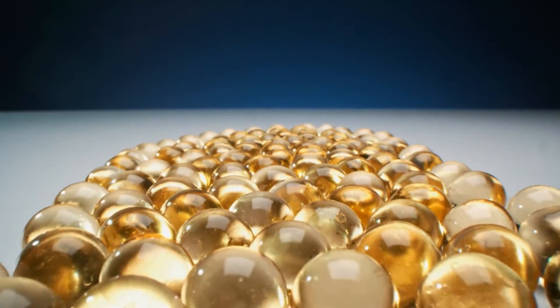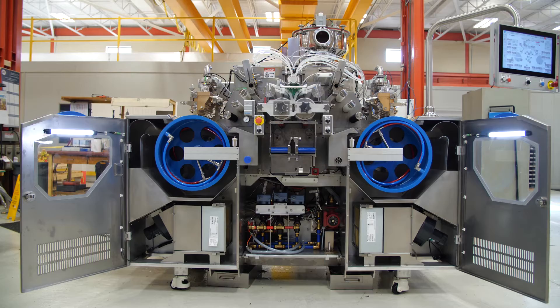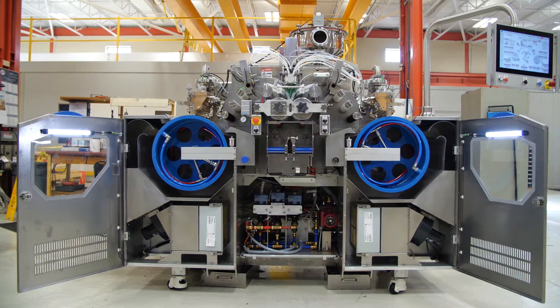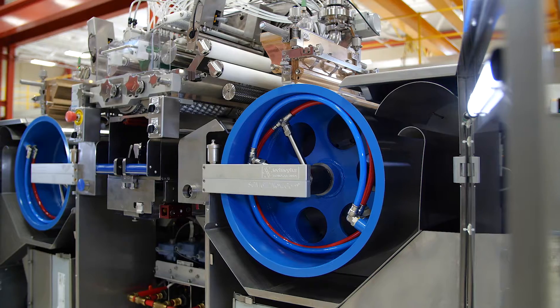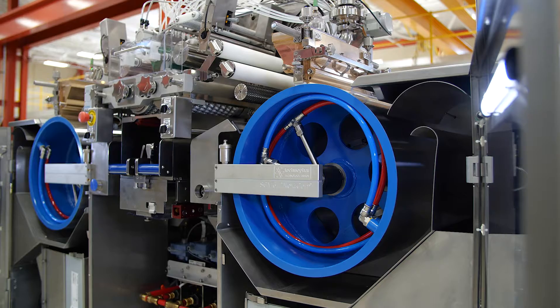Driven by a fundamental principle to improve on industry standards and TechnoFAR being the pioneer in the industry to change soft gel machines from mechanical to electronic gearing, upgrading our soft gel machine portfolio.